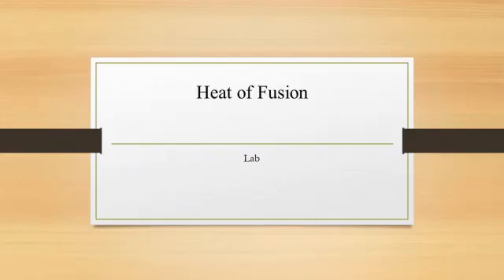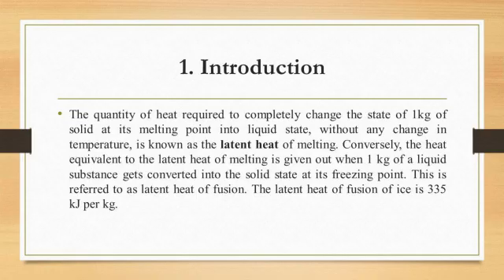Today's lab is on heat of fusion. Actually, this lab deals with finding the experimental value of heat of fusion of ice and then comparing it with the theoretical. Now, introductory bit, you have to know what the latent heat of fusion means.